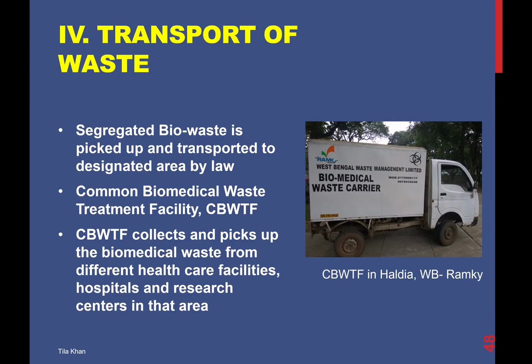The laboratory bio-waste cannot be disposed of anywhere in the environment. It has to be picked up and transported to a designated area by law. And this is done by common biomedical waste treatment facilities. These facilities are spread across India. What these facilities do is collect and pick up this waste from different hospitals, healthcare facilities, and research centers, and take it to the nearest disposal site.